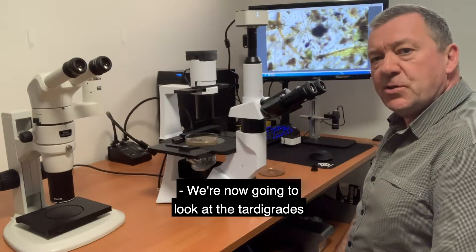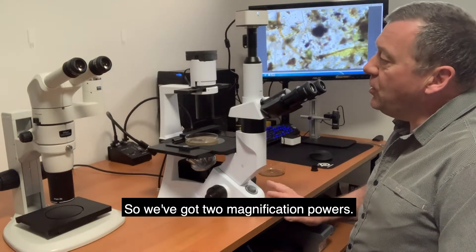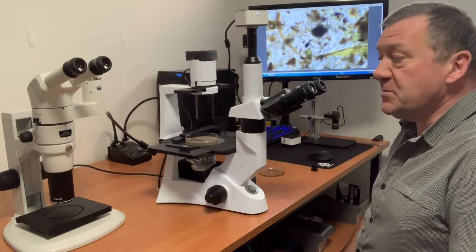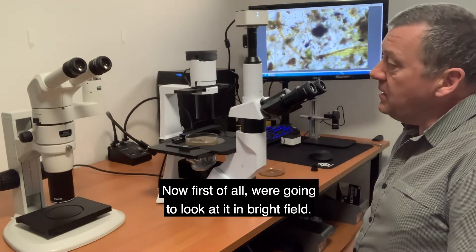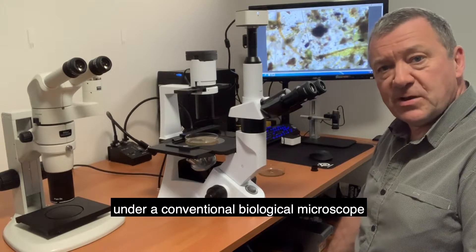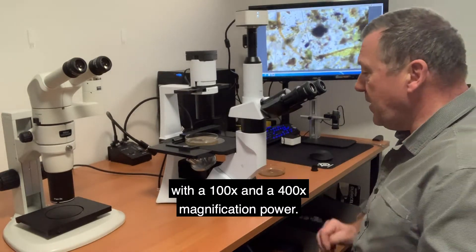We're now going to look at the tardigrades on this inverted microscope. We've got two magnification powers — we're going to be looking at it under 200 times and 400 times. First of all we're going to look at it in brightfield. You'll be able to look at tardigrades yourself under a conventional biological microscope with a 100 times and a 400 times magnification power.